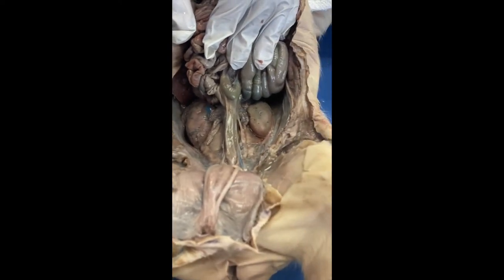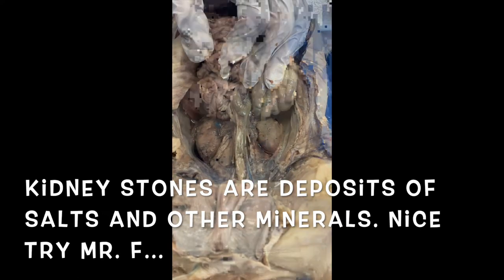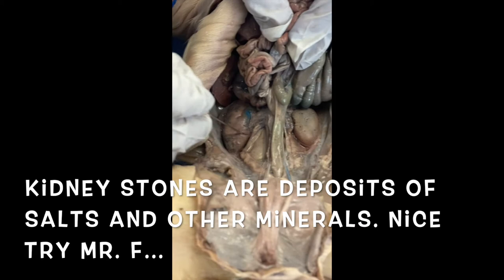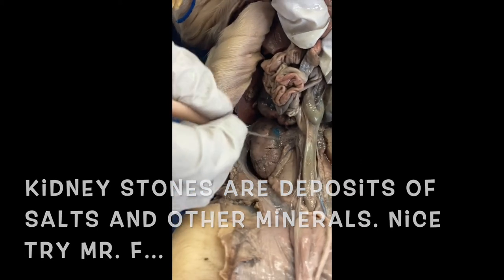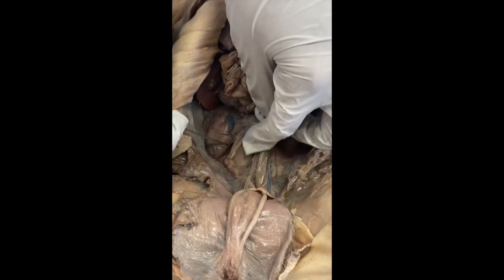Now, a kidney stone is a buildup of calcium. Is that right? Minerals, but I actually don't know what all of them are. Okay, I'll have to look that up. All right. So from this pig's point of view, this would be the pig's right kidney. This would be the pig's left kidney. And then there's this, too.